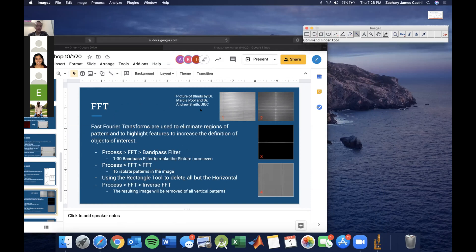The next analysis we're going to use is fast Fourier transforms. Freshmen will be using this in BioE 100 in the coming weeks. It's a filter of an image that can find areas of pattern and subtract them, add them, or compose them together. So that's what we're going to do right now — a little walkthrough.